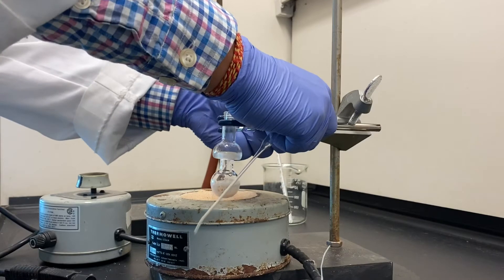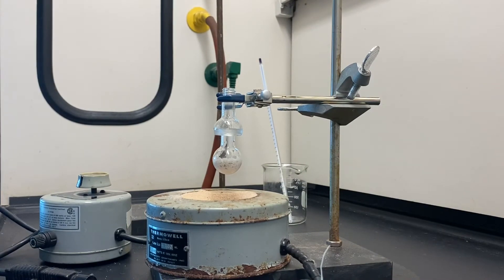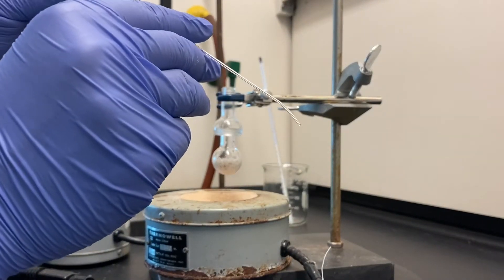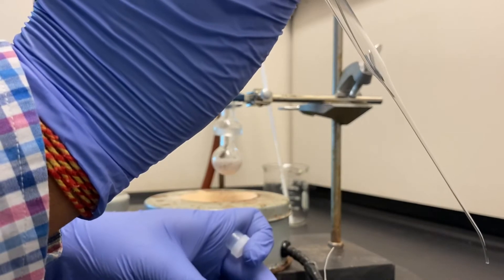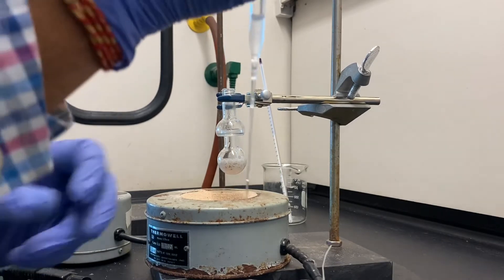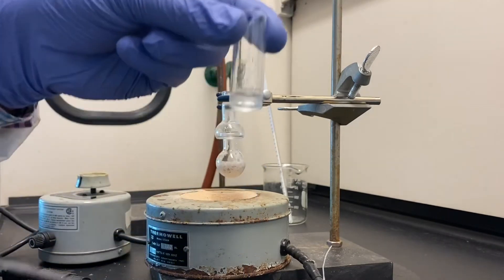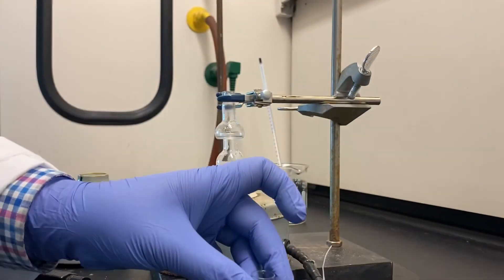Raise the clamp on the ring stand, lifting the Hickman still from the sand, and let the apparatus cool to room temperature. Transfer your product from the collection ring into a shell vial using a slanted pipette, which your instructor will provide. Examine the product in this vial; if there is a bubble of water in the bottom, carefully pipette out the water, leaving the product.